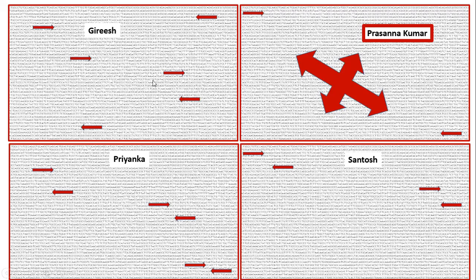Given that there is specific primer binding, the gel will show different bands based on whoever it is. Based on 3 bands, it is Priyanka. Based on 2 bands, it is Santosh. Based on 1 band, it is me. And based on no band, per se, we are all biotech. He is the odd one out, the guy in the chemistry department. And luckily, the gel also is not giving any band at all.